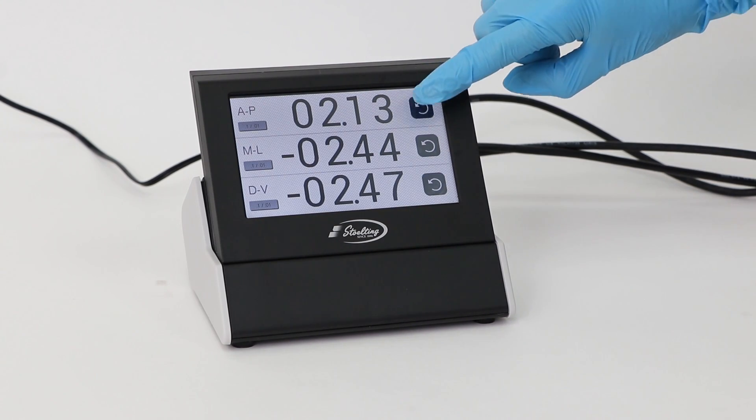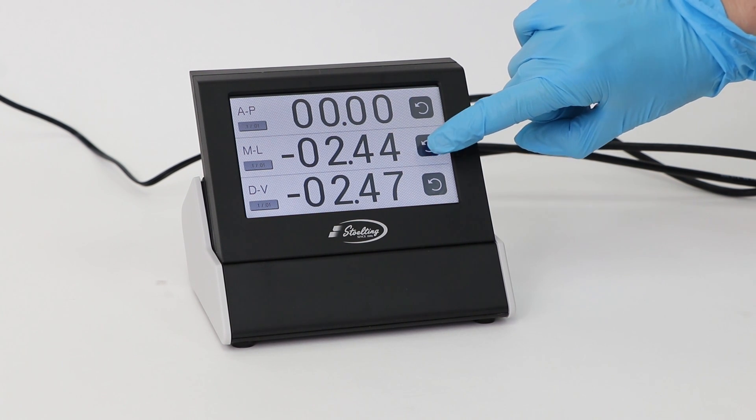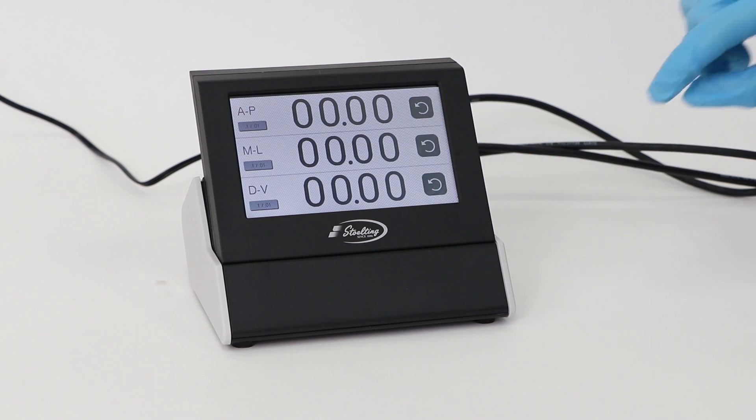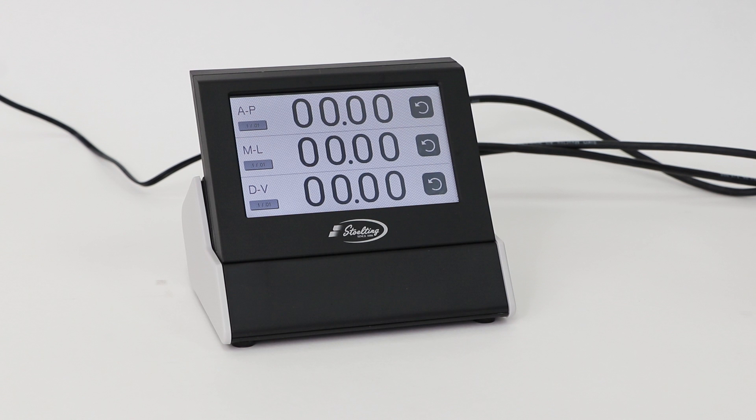Be sure all coordinates on your digital display are zeroed prior to surgeries to ensure accuracy in your starting position.